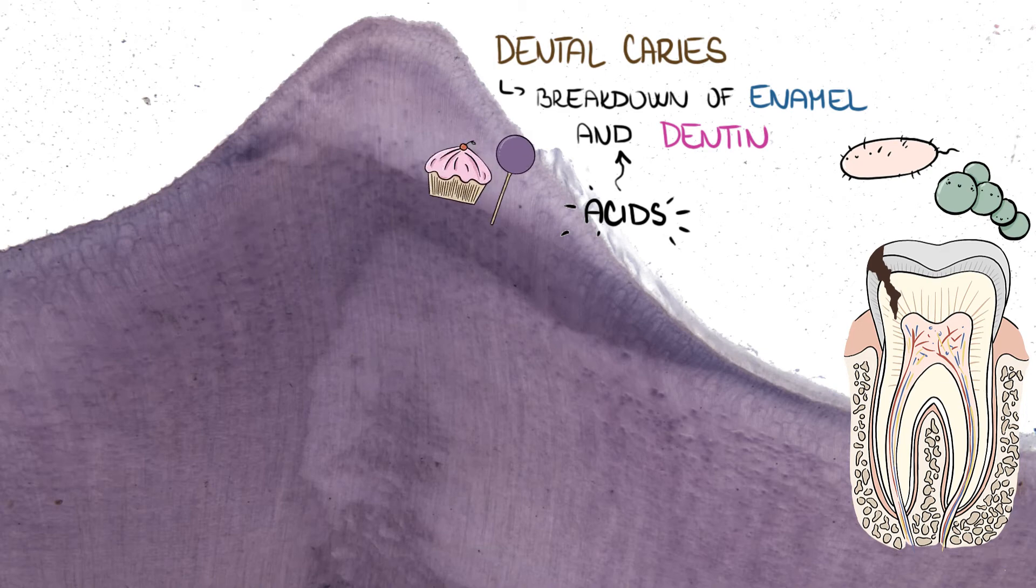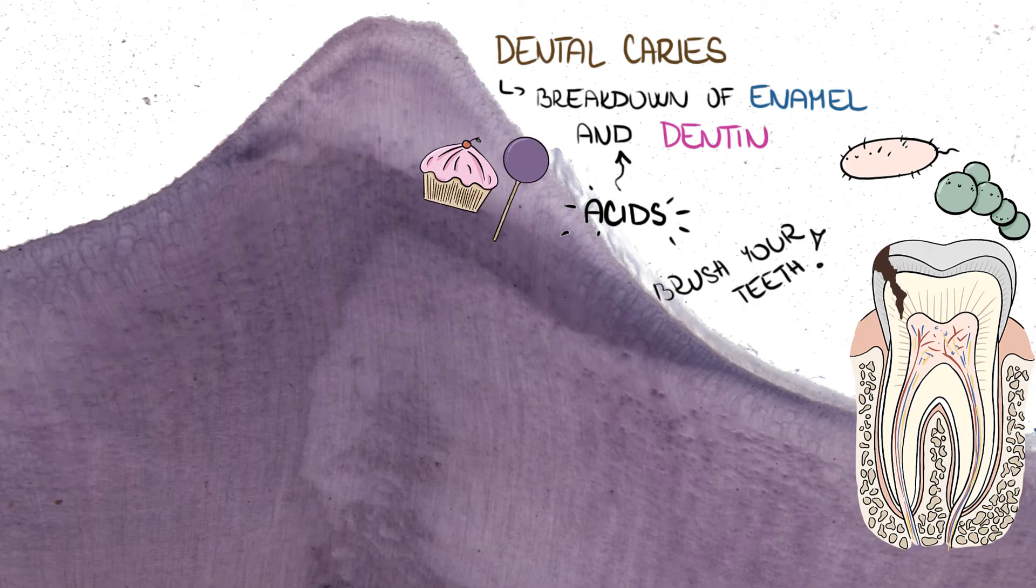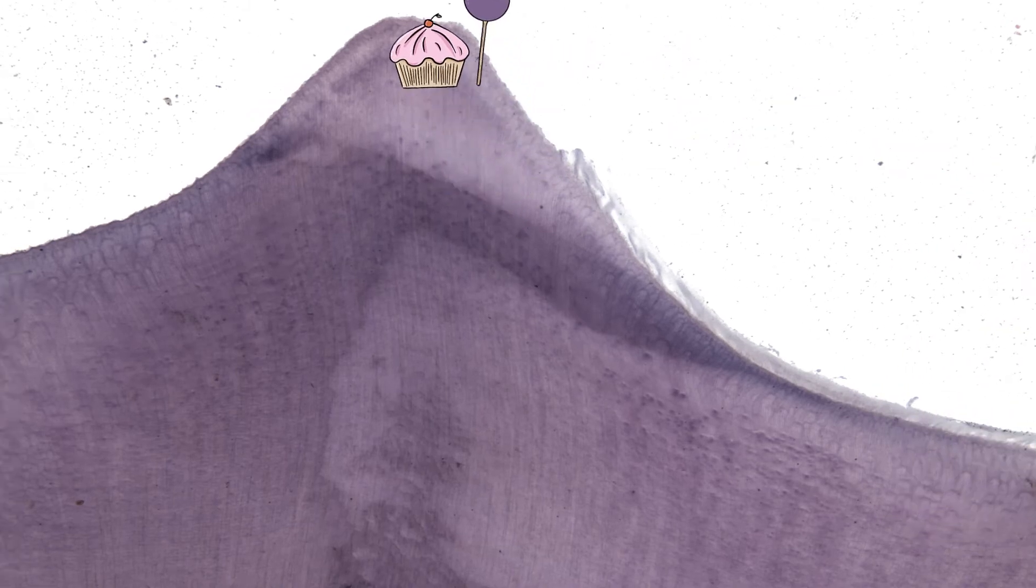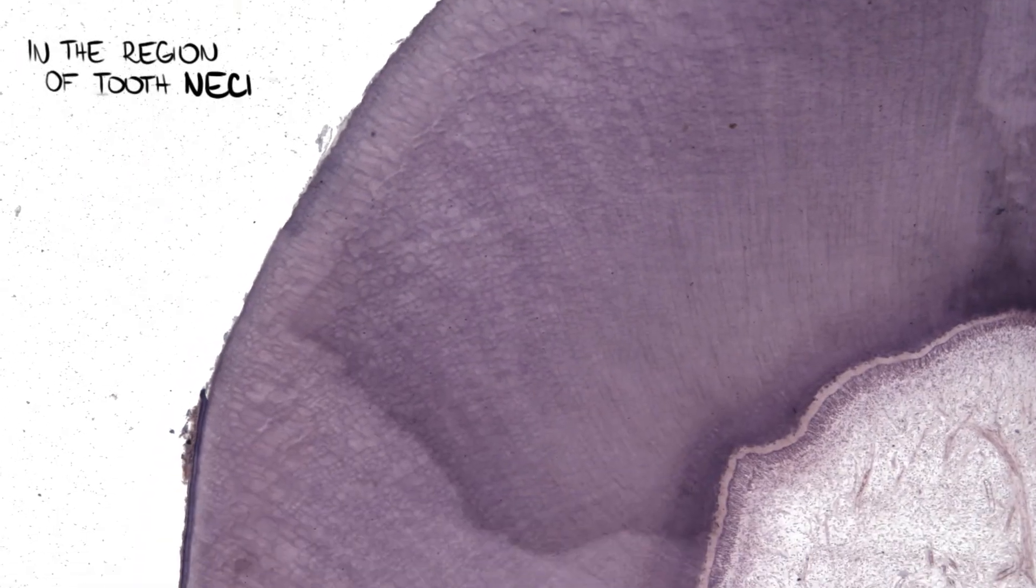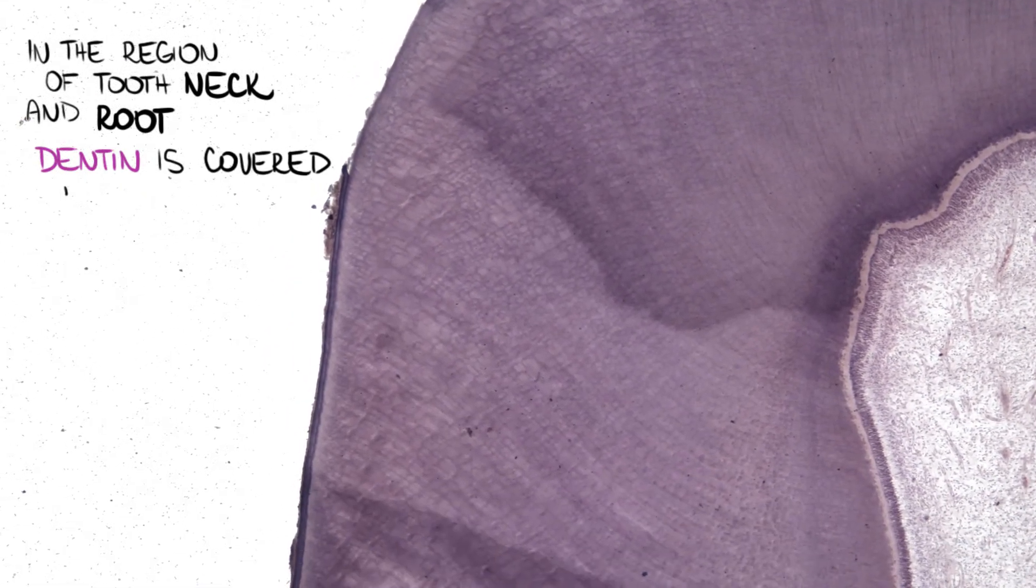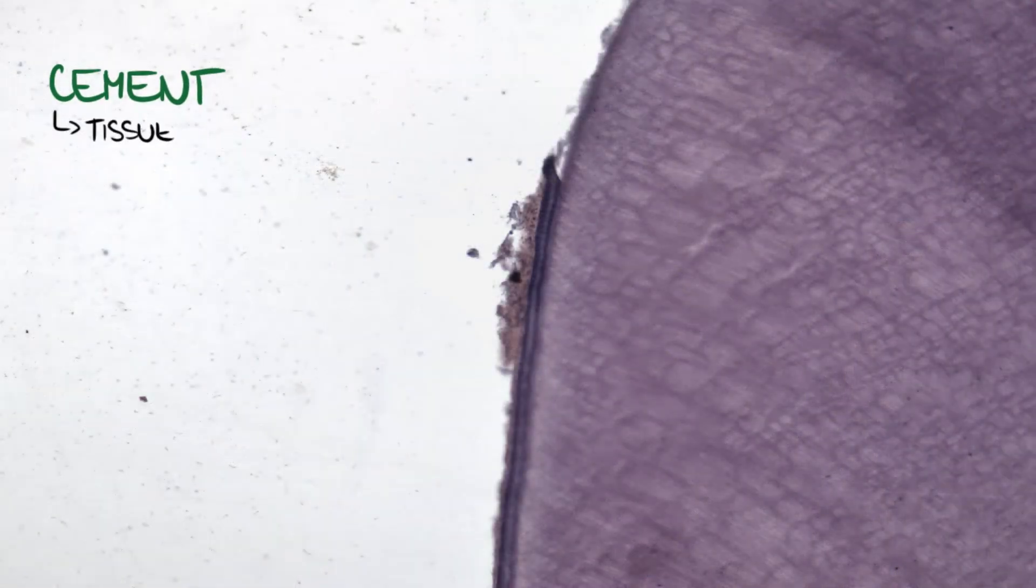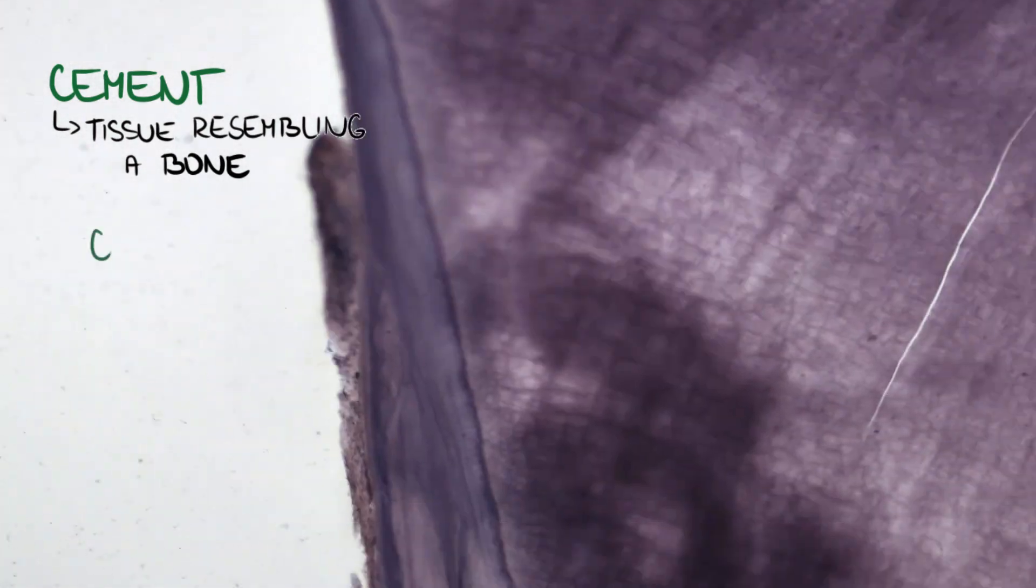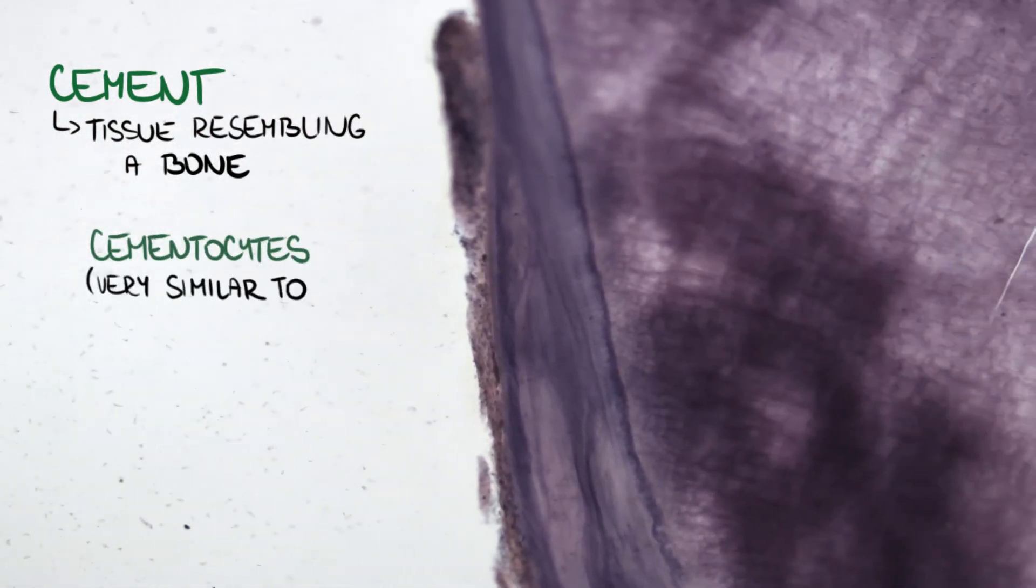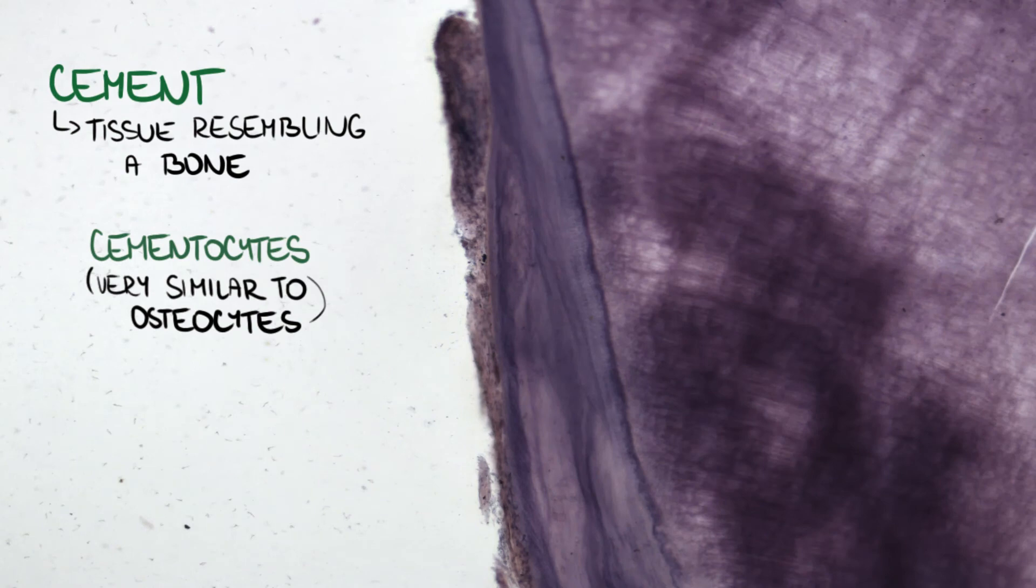In the region of tooth neck and root, dentin is covered by a substance called tooth cement. It's a tissue resembling bone. In thicker areas it contains cementocytes, which are very similar to osteocytes. In the picture we can only see empty lacunae where cementocytes used to be.